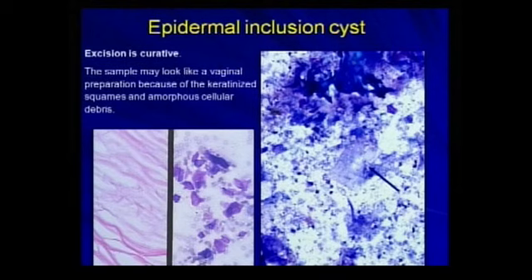it's very difficult to make more of a determination whether it's just a follicular cyst or it's actually a neoplasm. And usually our recommendations in our diagnosis letters would be that if clinically warranted, excision and submission for definitive diagnosis is appropriate.